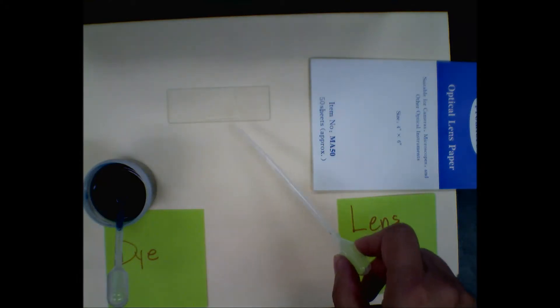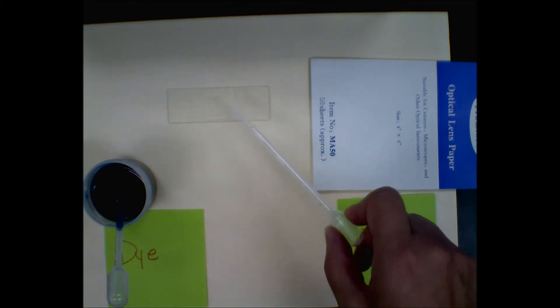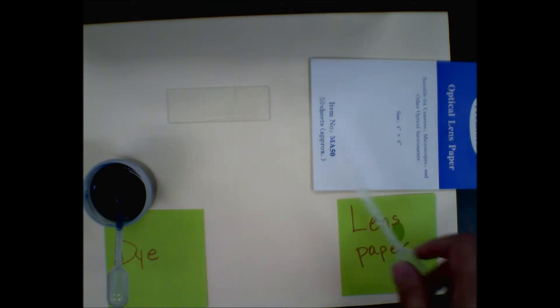Here I have a wet mount slide of some cheek cells. This is colorless because cheek cells don't have any color and it's just been recently made. Here I have lens paper and here I have dye.